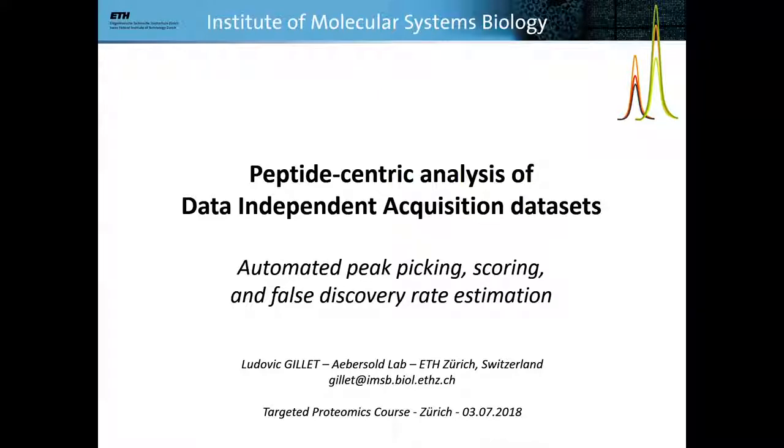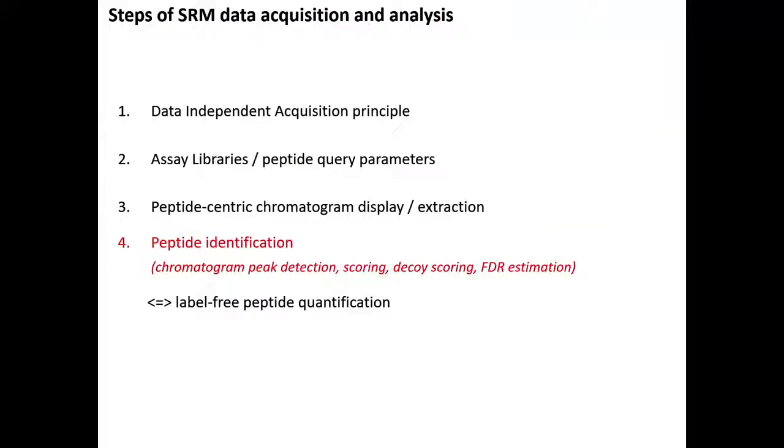So Ludovic, please. Hi everybody. Is it okay? Yeah. You heard already from Mike the peptide-centric concept. I'm just going to re-summarize it quickly, and then I will show you some basics about how we do the peak picking, the scoring, and the false discovery rate. So we stand now about here.